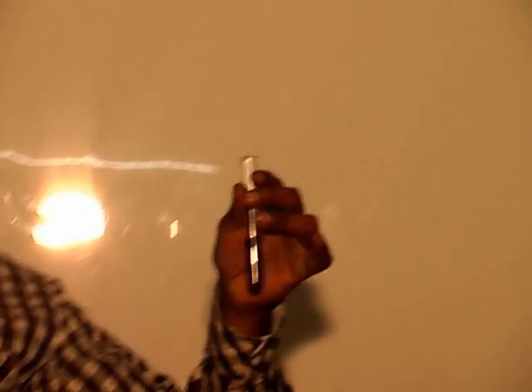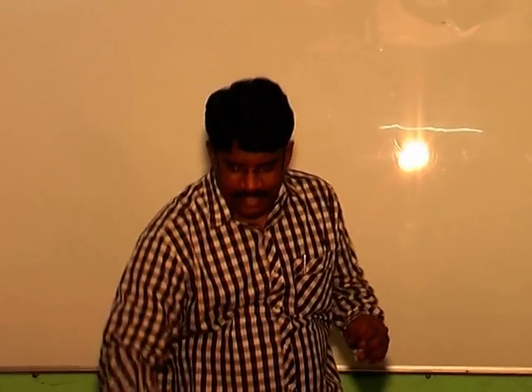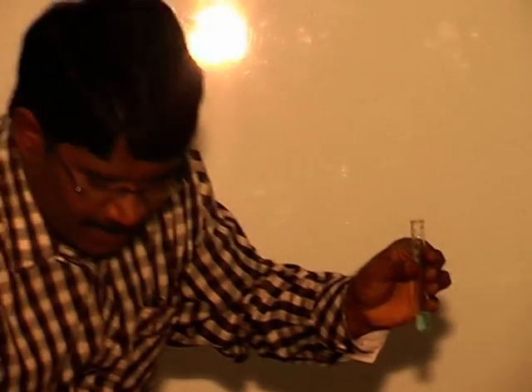If the black precipitate is formed, then the second group cation, that is cupric ion, may be present. If ever we get this black color precipitate, then immediately we need to do the confirmatory test for cupric ions. Again I am taking the salt solution, and to this I am adding ammonium hydroxide.